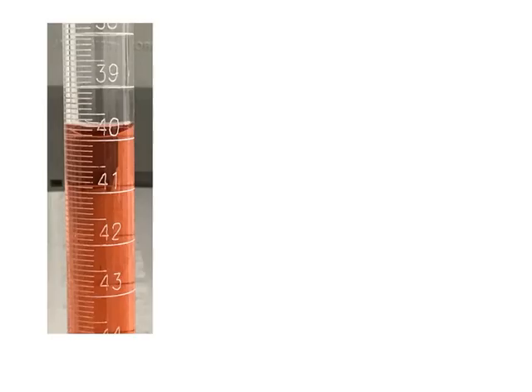Okay, so I've got a burette set up. It's important that you read this the proper way. Notice we know for a fact that the reading of this burette is between 39 and 40. You'll also notice the burette is written upside down. That's not such a big deal right now, but we know for a fact this is between 39 and 40. And each one of these little ticks over on the left side is 1/10 of a milliliter. So we know for a fact, and we're going to read the meniscus, that it is beneath this tick and the actual 40 tick. The meniscus is falling between this last tick and the large tick for 40. So we know that it is 39.9.